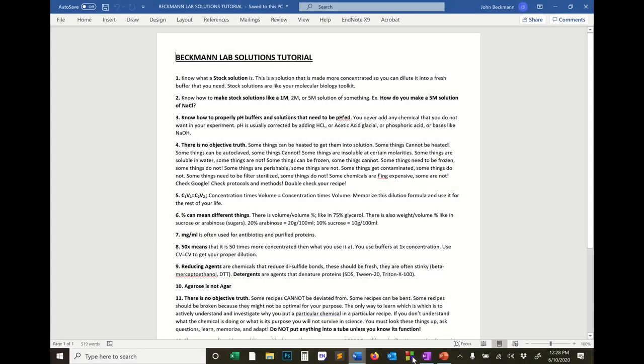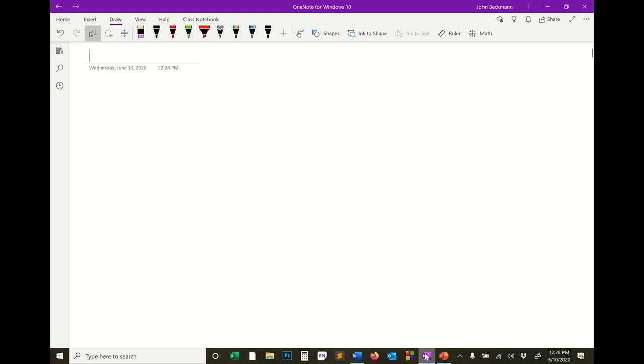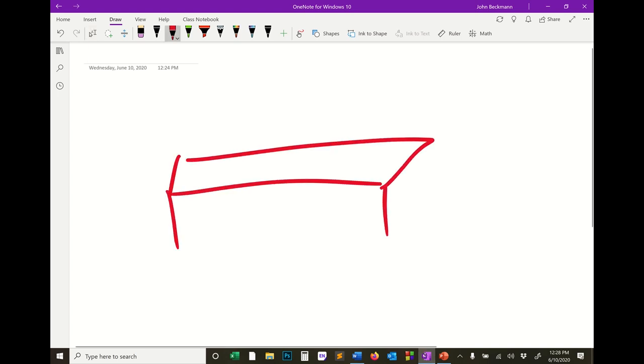I do. Okay. So I have made here a document that is a good primer, a good tutorial on what to do when you first join a wet lab. When I say wet lab, that means you're going into a lab that has a bench, it's got a Bunsen burner, and you're gonna start to do some experiments.